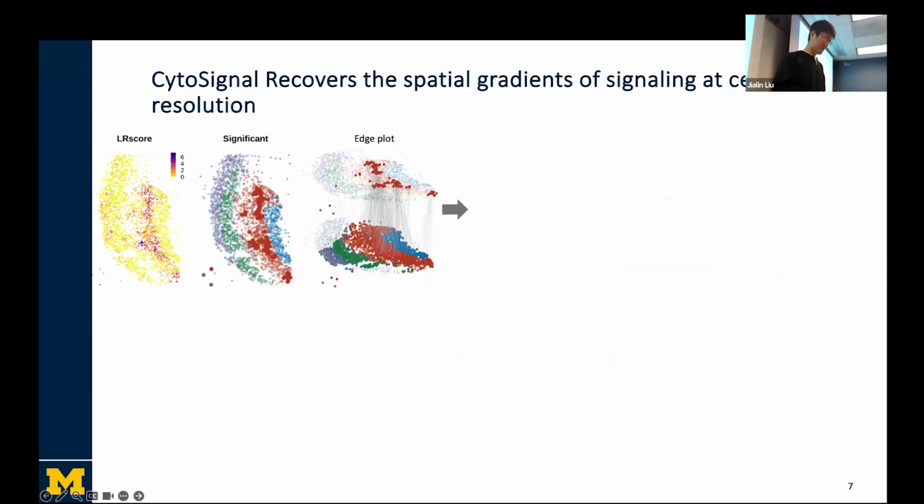Let me show some results here. So, we already have the algorithm, and we definitely want to apply it on different kinds of systems. We first applied it on the Slide-seq mouse embryo data, on the mouse embryo cortex captured by the Slide-seq data set.